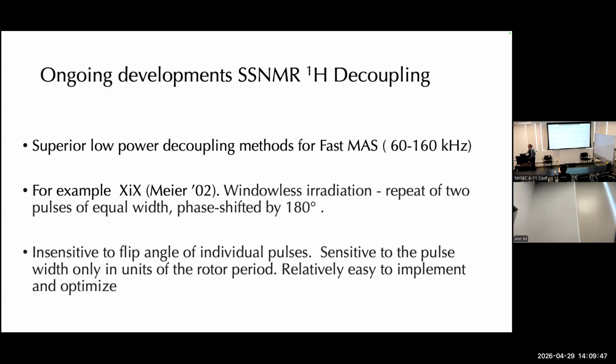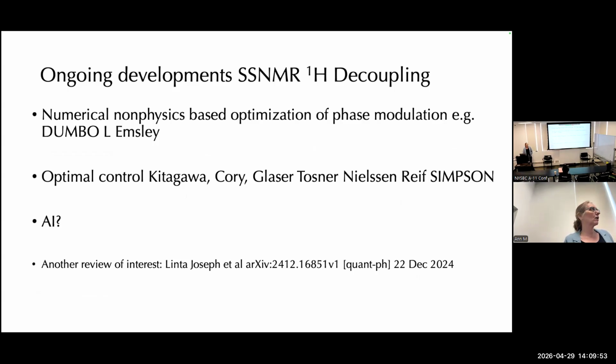So that's a lot of virtue. And so it is working in a different regime. These two pulse sequences that I'm mentioning are, I think, impactful day in, day out. Look at the papers from solid state NMR, look at the pulse sequences we have installed here. You're going to see this acronym. So at least I'm giving you a basic level description of what the pulse sequence is, what its properties are, and why it was needed. But I didn't really give you the average Hamiltonian treatment of it because you're not going to get something elegant in closed form out of it. So if one of you is actually interested in this, for your paper or for something you're doing, we can certainly talk about it.